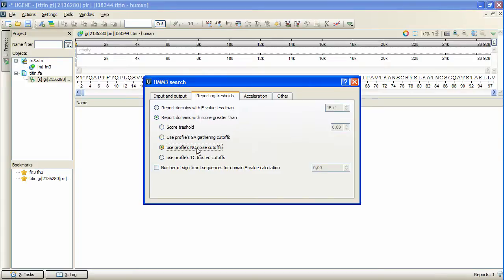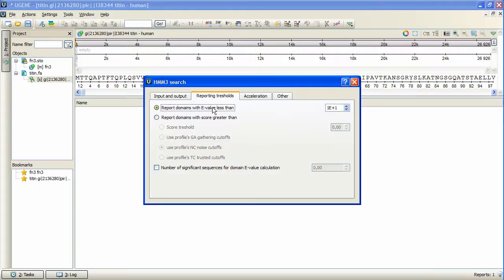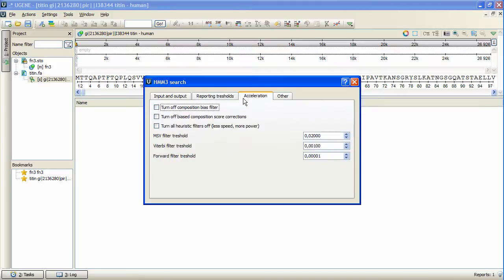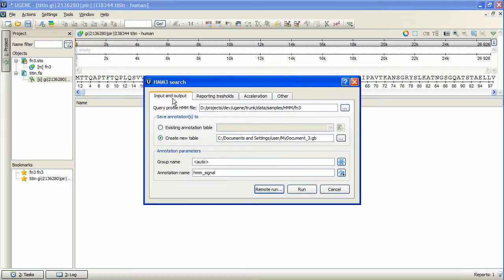We will filter the results by E-value. The Acceleration tab allows us to accelerate the search if needed. When the options customizing is done, we go back to the Input & Output tab and press Run.